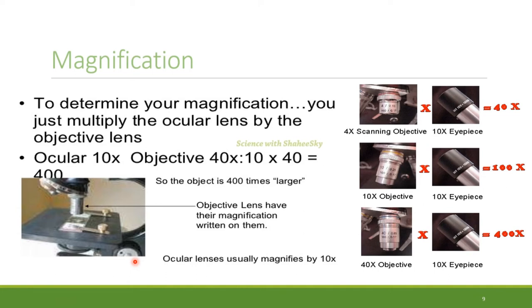When we are learning about the microscope, we have to learn about magnification. Let's move on to what magnification is.